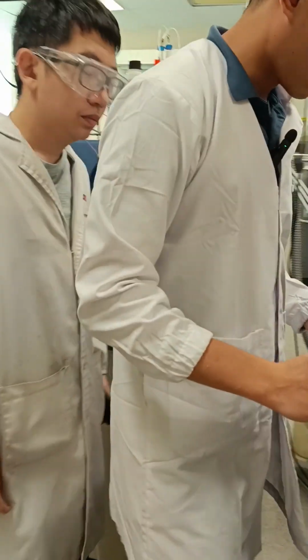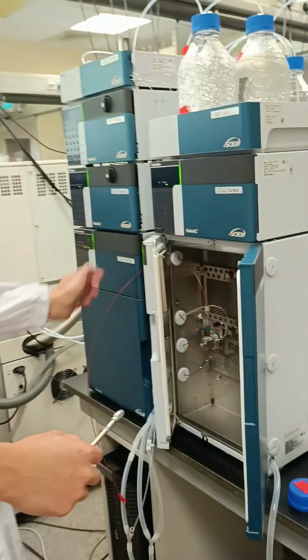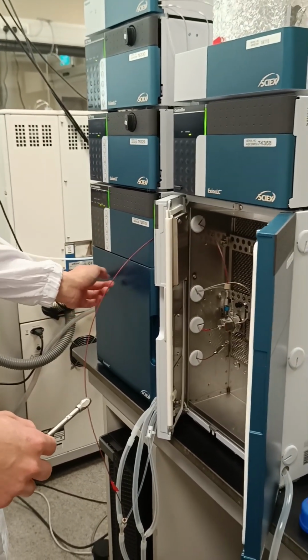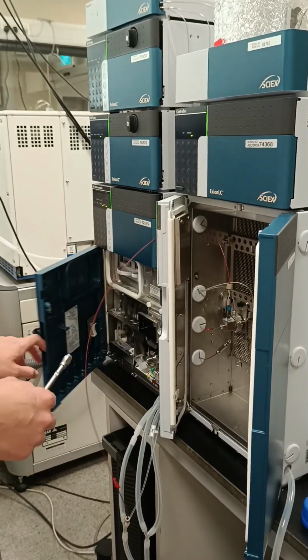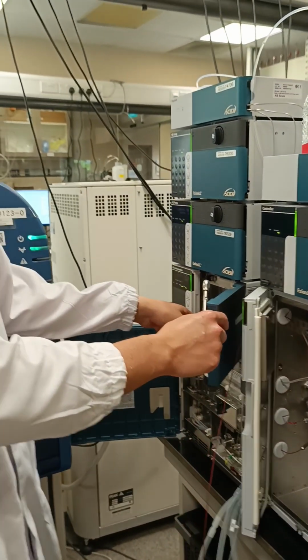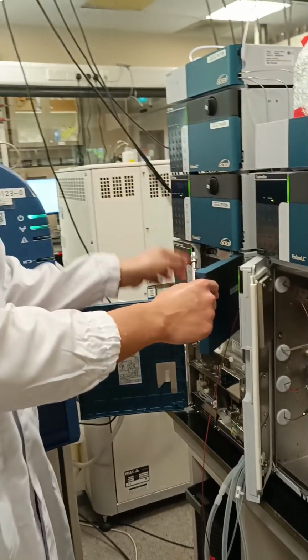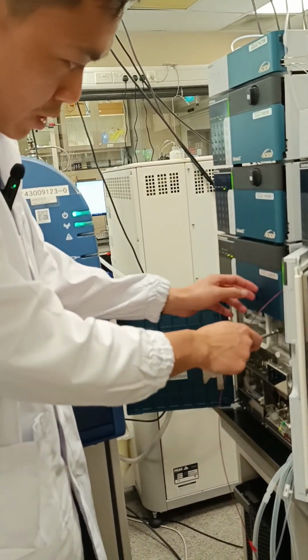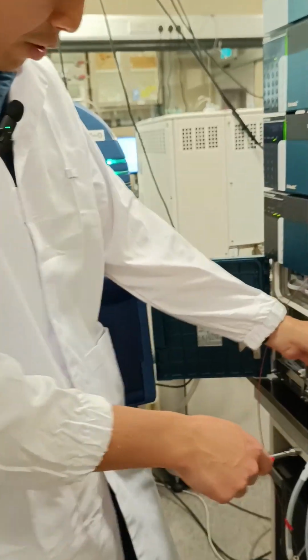Usually the direction of the flow will be, here is the autosampler. This is where you load your samples, and the needle will inject through your vials here and extract the samples from here. So the direction starts from here, through this small red line.